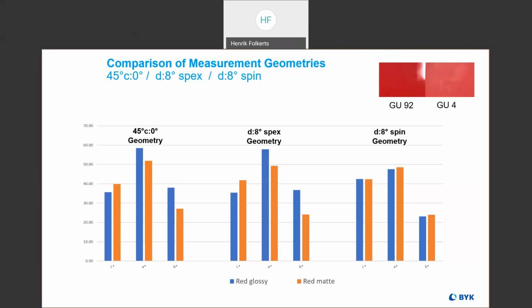Question here, too. What would be a good instrument to measure the color temperature of luminaires? Oh, so that's called a spectroradiometer. We do not make those. Reflective spectrophotometers, such as we sell, are for shining light on a surface and then measuring what the material does to it. What you're talking about is measuring the spectrum of light being given off by a light source, and that's a radiometer. That's not something we make or sell.